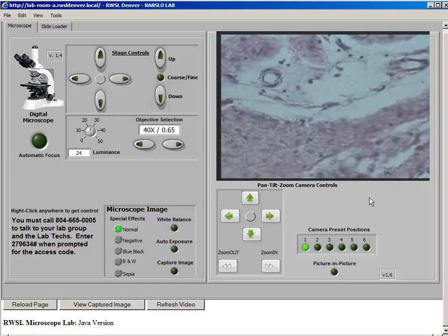The camera control unit is equipped with a series of image processing functions that enable you to quickly and easily correct imaging problems that arise from low or high contrast, poor focus, insufficient or uneven illumination, sample shading, or discoloration and noise. The most common reason for uneven illumination is a light source that does not completely fill the field of view on lower magnifications.